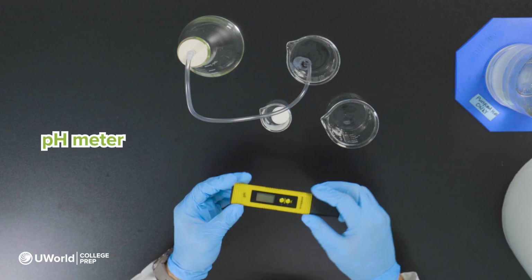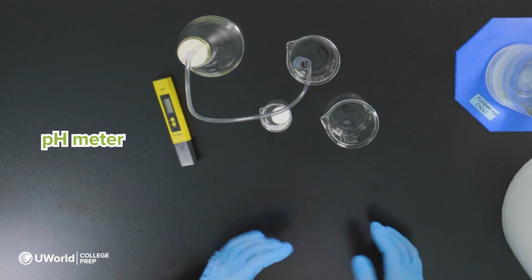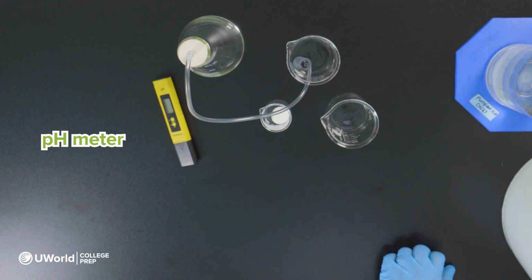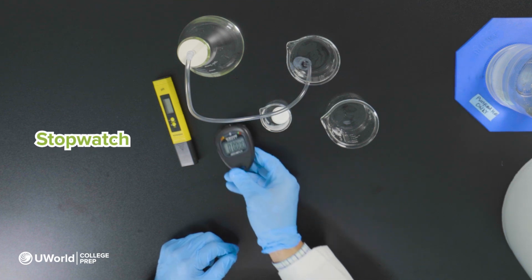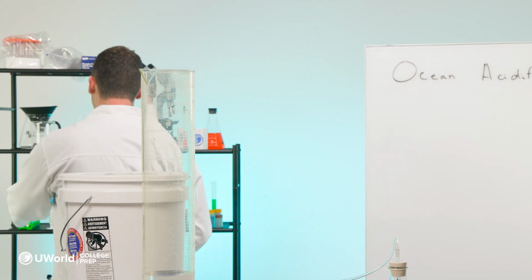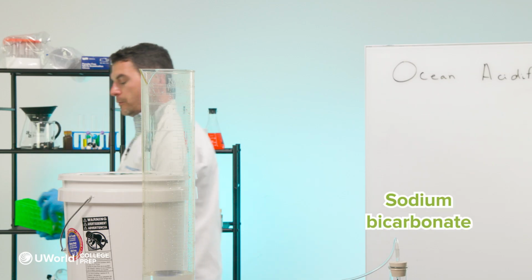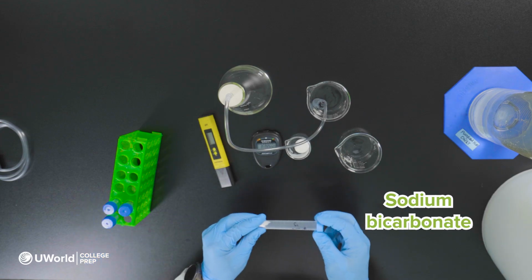Next, we'll need a pH meter. This pH meter will continuously test the pH of our water as it changes throughout the experiment. We will need a stopwatch. And finally, we'll need some sodium bicarbonate, which I've already weighed out into 1 gram increments.